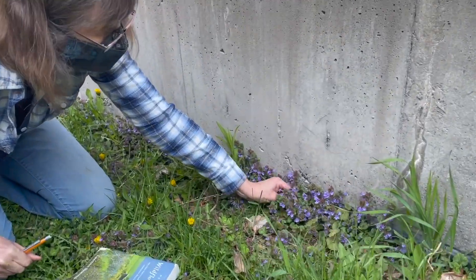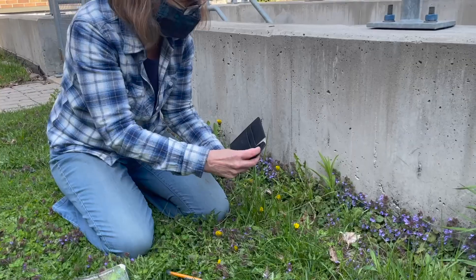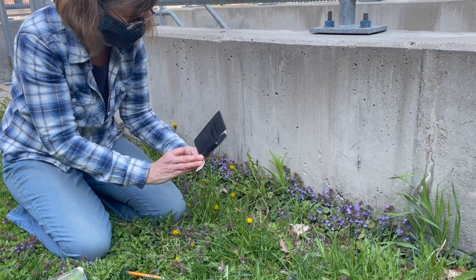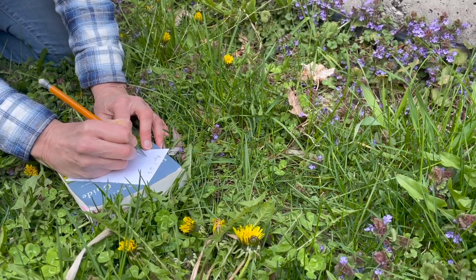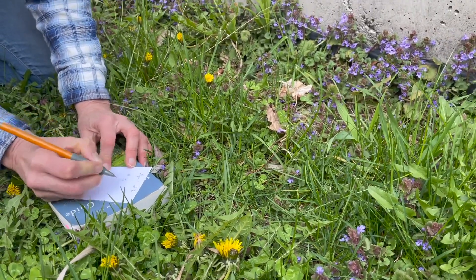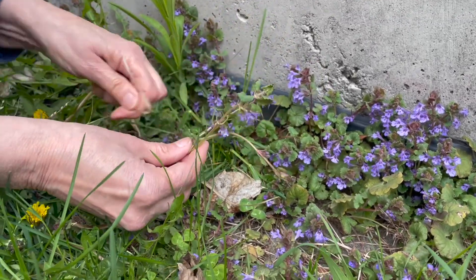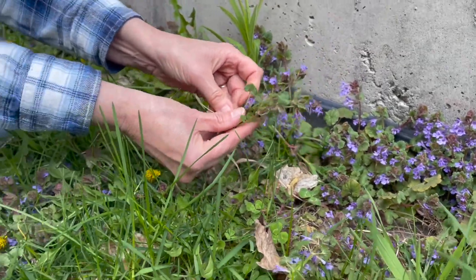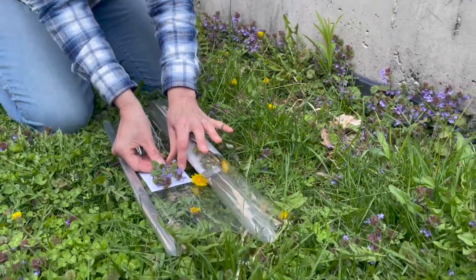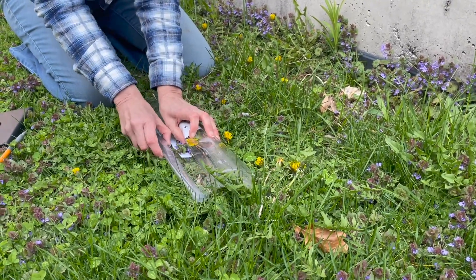Here we have our third plant we will be collecting. First we will ID it with Newcomb's Wildflower Guide and take some pictures. We will now create a label and a reference in the field notebook noting the species, where it is found, and any other things to note. Then we can take a few samples of the plant getting as far down to the base as we can. A scroll of 1 to 1.5 meters will hold about 20 specimens and when ready to press we just unroll the scroll.